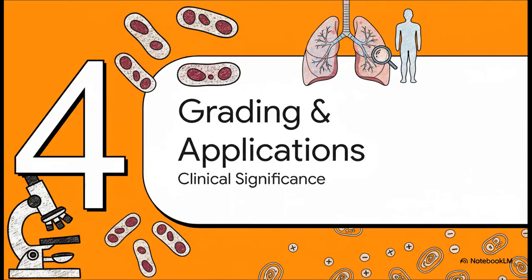So, okay, great. We see red rods on a blue background. But what does that actually mean for a patient? Let's shift gears now and talk about the clinical side of things, how this simple stain becomes a life-saving diagnostic tool used every single day.